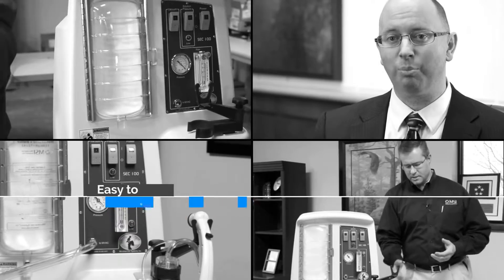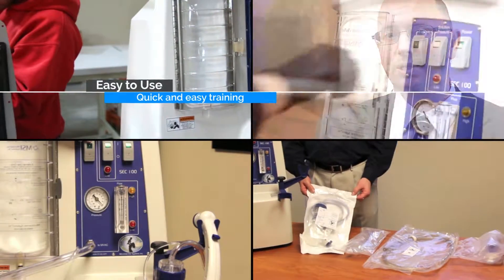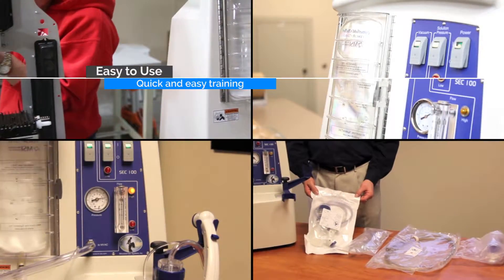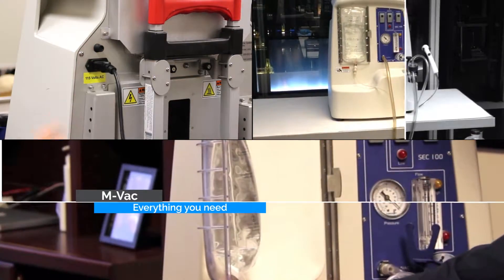Fortunately, the MVAC is easy to use and the training is less than one day. Investigators can rest assured that the system is not only effective, but is also simple, user-friendly, and sterile. The MVAC system consists of the core equipment that houses the vacuum pump and solution delivery system.